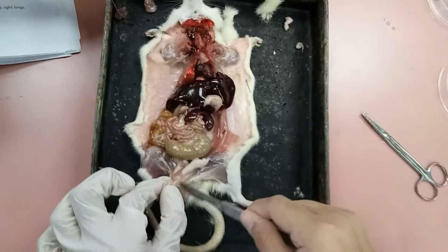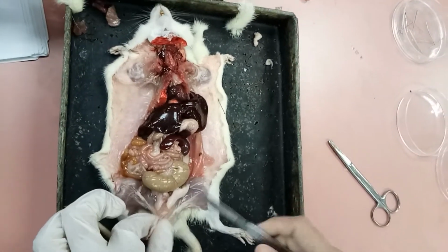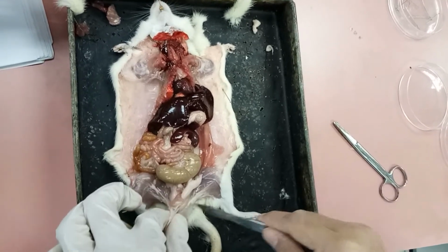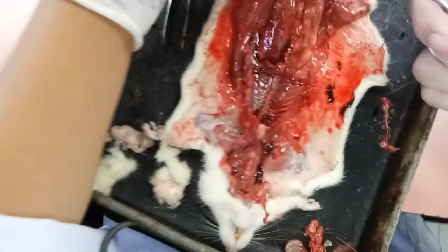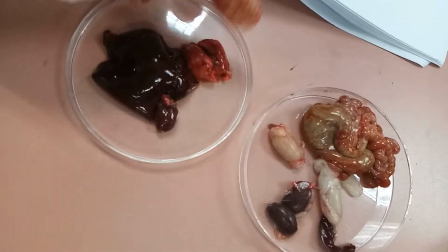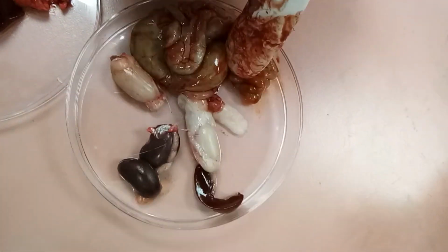Now we are going to take out the organs, because later we are going to preserve them and prepare slides from each of these organs. Now all the organs have been removed from the body. This is the liver, the lung, the testis, kidney, large intestine and small intestine. This is the heart.